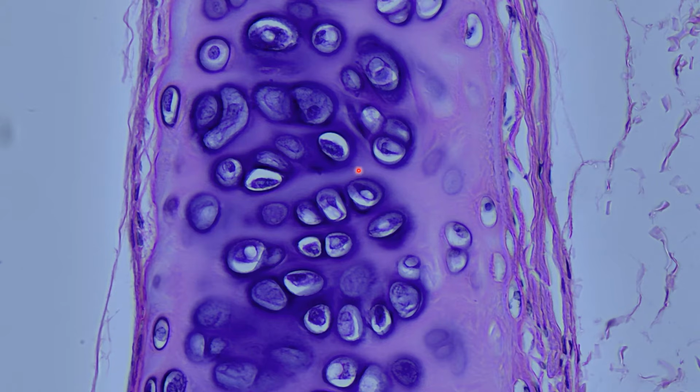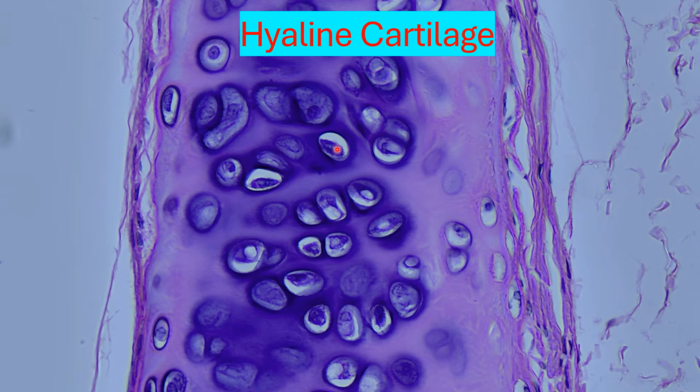So with this, we can see that there's these clear empty spaces. Those spaces are the lacuna, and inside of that exists a chondrocyte. So therefore, we have a cartilage of some sort. This one is hyaline cartilage, and it has this glassy-like appearance to it.